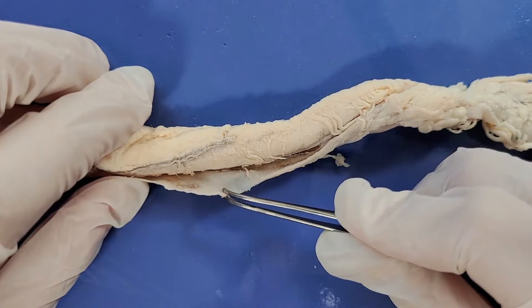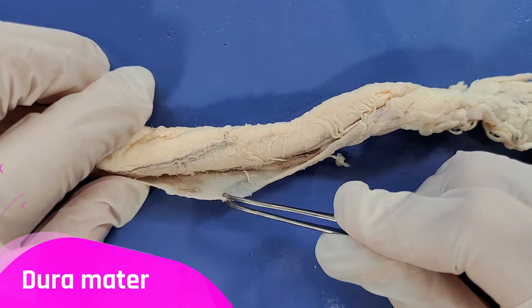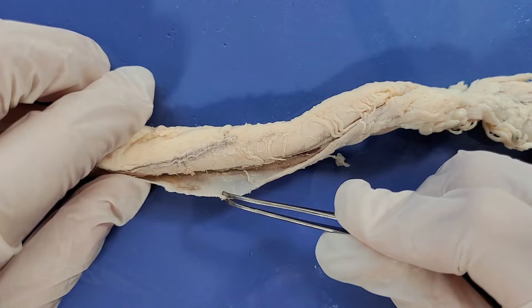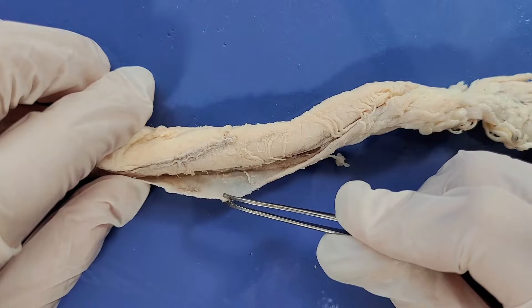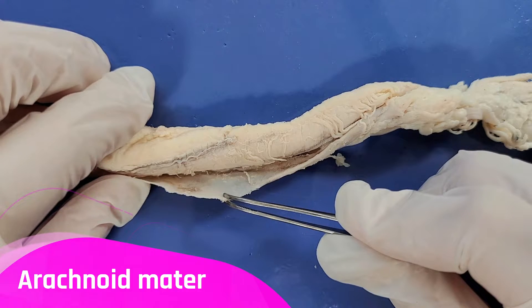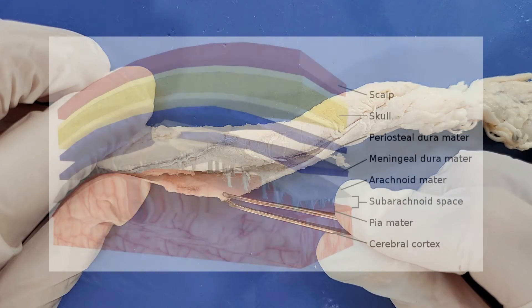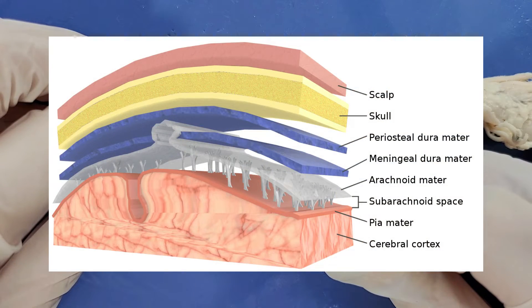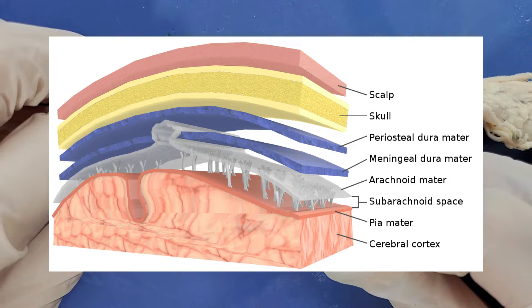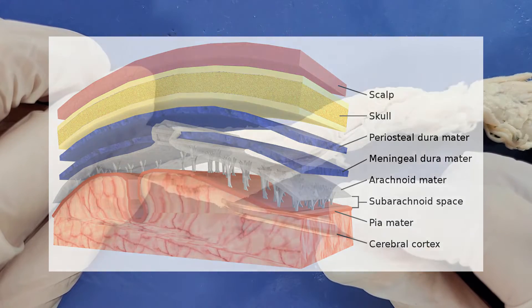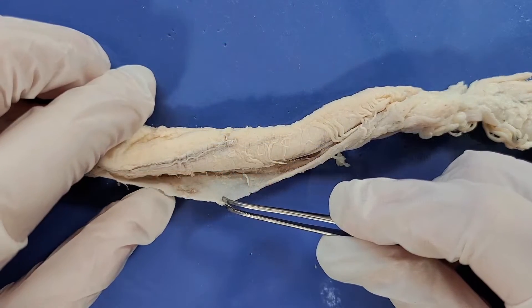The outermost layer is called the dura mater and it's a thick, tough layer as you can see here. The middle layer is called the arachnoid mater, which is a delicate spiderweb-like layer. The arachnoid mater is ballooned up very closely against the dura mater — it's actually so thin and so close to the dura mater that it won't really be visible, but it will be located right below the dura mater around here.